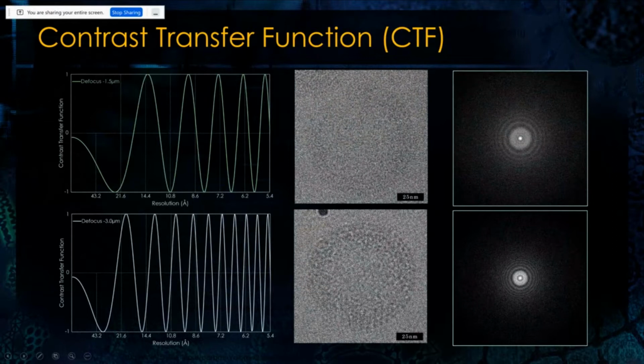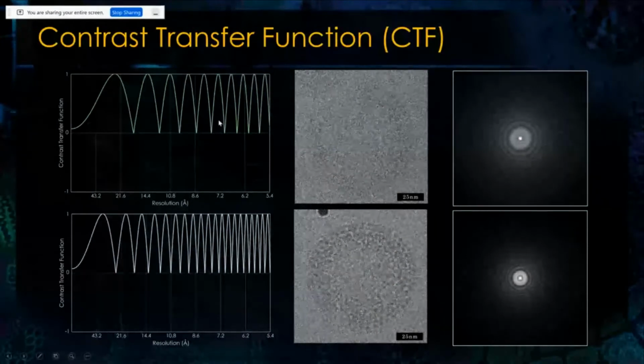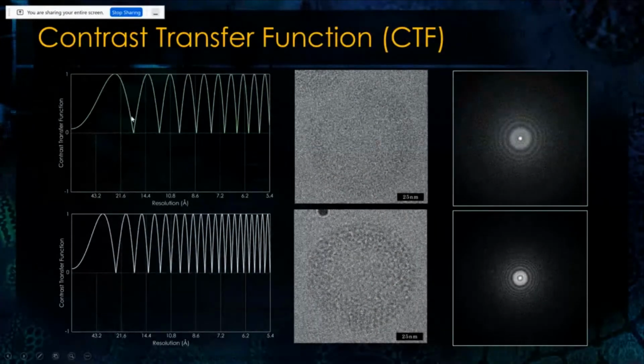So what we can do about this now is we have to somehow correct it. At least we have to try to get the contrast on the same side. So we do something we call phase flip, where we make sure that at least the features have the same contrast. And we can also do multiplication, which would also somehow boost the signal here and may try to push it up to this one.